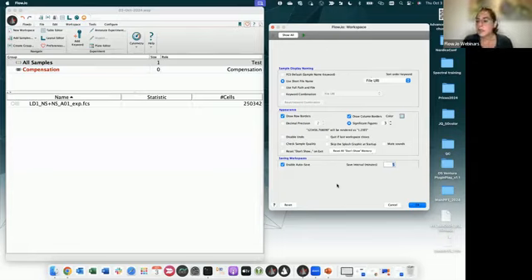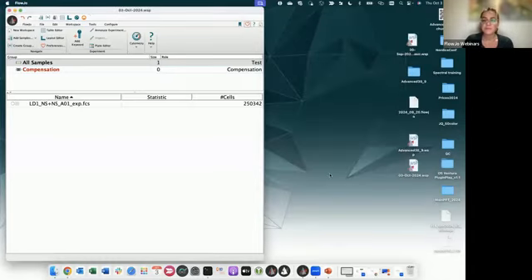Okay, so I will move on to the next question that I got from the mailbox, which is, why does my template not apply to new samples even though it's the same panel and experiment? How can I fix or prevent this from happening? Well, first of all, let's say, what is a template?